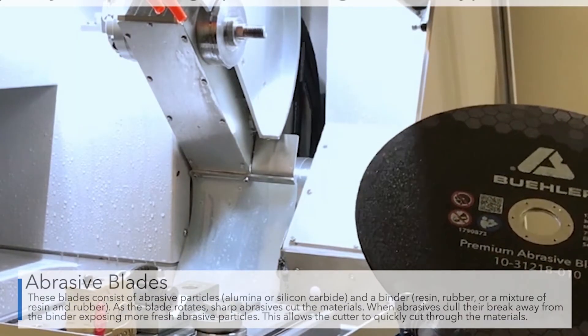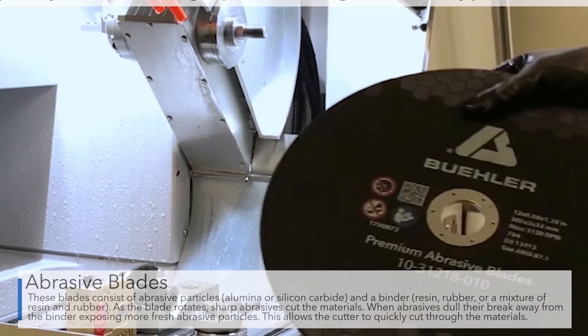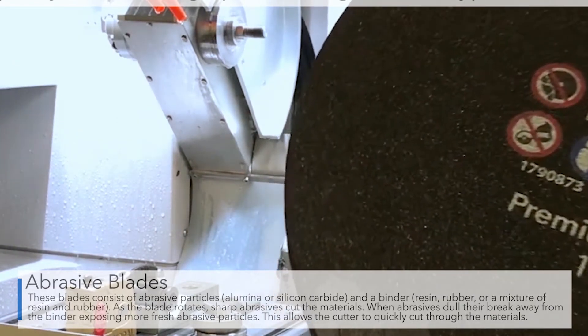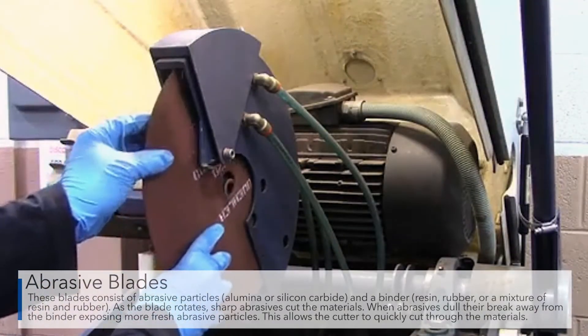These blades consist of abrasive particles and a binder. As the blade rotates, sharp abrasives cut the material. When the abrasives dull, they break away from the binder, exposing more fresh abrasive particles. This allows the cutter to cut materials quickly.